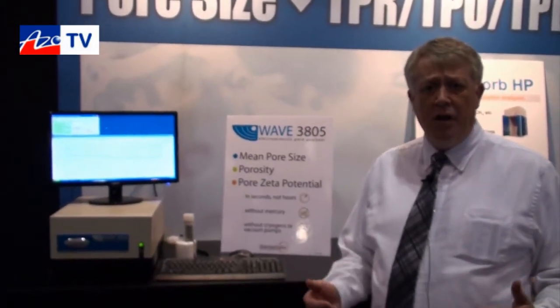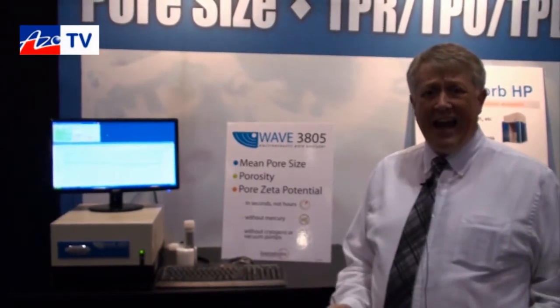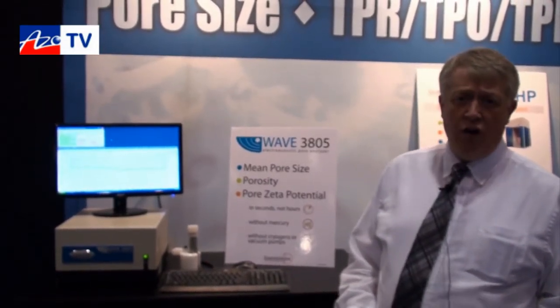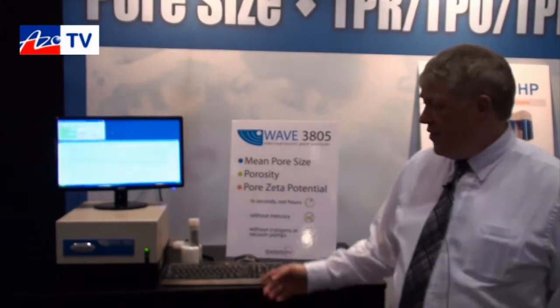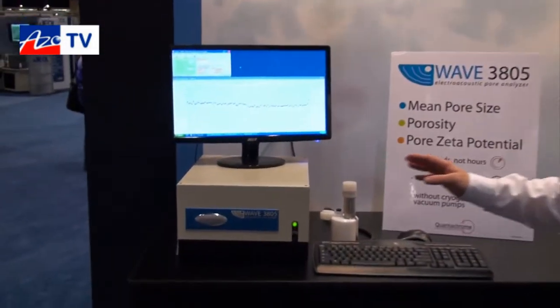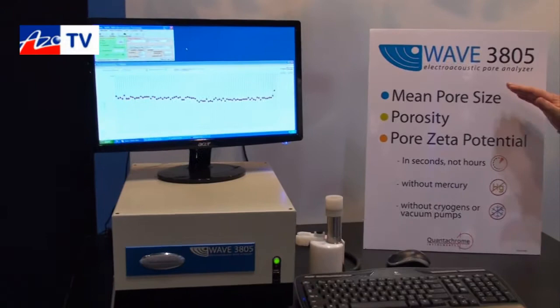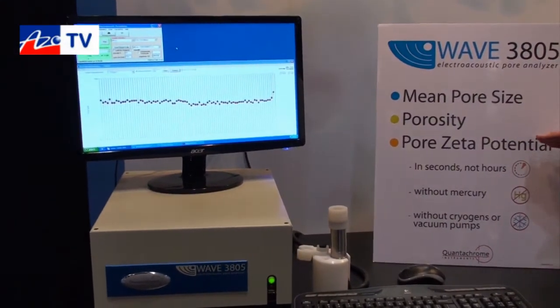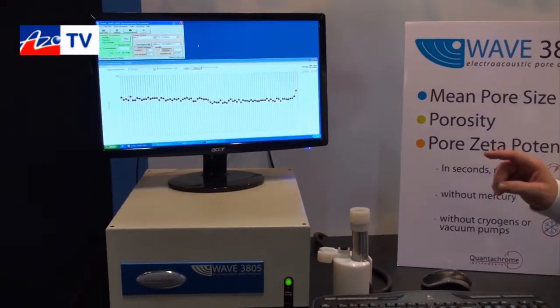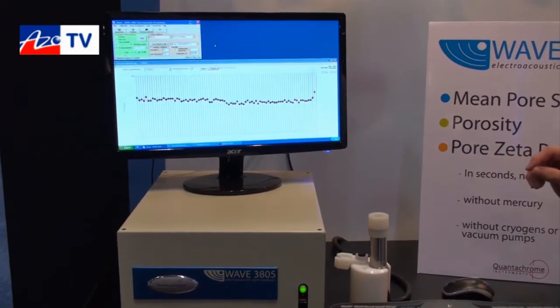So we're giving those people an alternative means of measuring average pore size using brand new technology for this type of measurement. The 3805 can actually analyze three porous material properties: mean pore size, porosity, and pore zeta potential. But what I'm going to show you right now is a very rapid analysis of average pore size, or mean pore size.